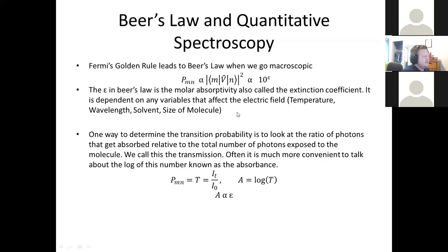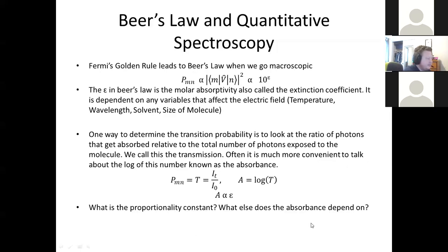But the other piece of that puzzle is that there's this thing called scattering. There's a certain amount of light that's going to scatter away, not absorb, and not just pass straight through the sample, but actually get scattered. And that depends on how long the path length is. So those are the two pieces that finish this off, essentially.